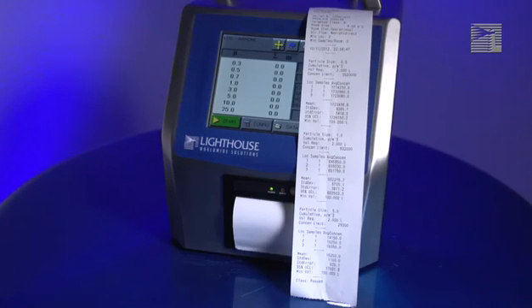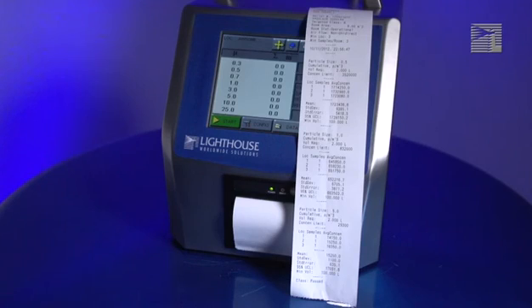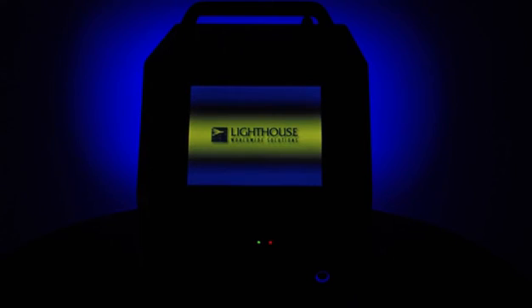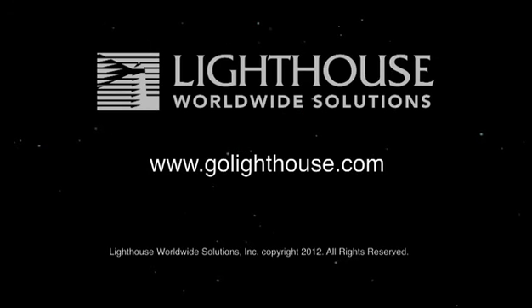The top portion of the printout displays the selected report information about the instrument and information about the area sampled. The printout then displays each particle size sampled and information about that sample size, including the report requirements, sample values, and statistics for the report. Press the Feed button on the printer to advance the paper to show the bottom of the printout, which displays whether the room successfully met the cleanroom classification chosen for the report. This concludes our training video on how to use the Reports function in the Lighthouse line of airborne particle counters. For more information on Lighthouse products, please go to www.golighthouse.com.